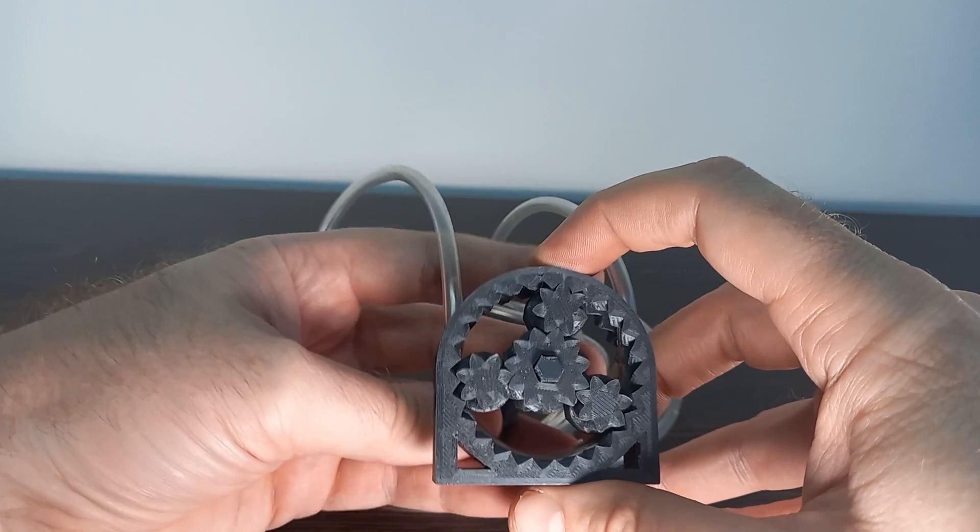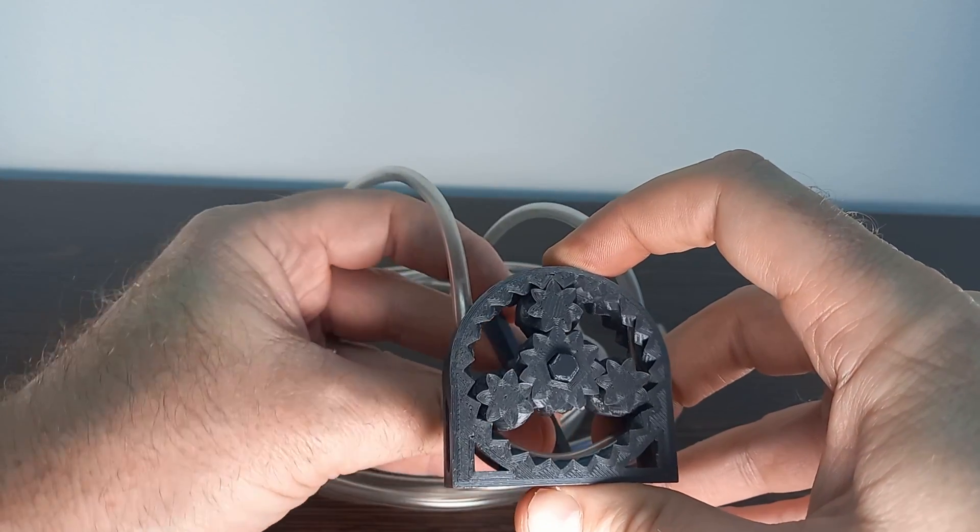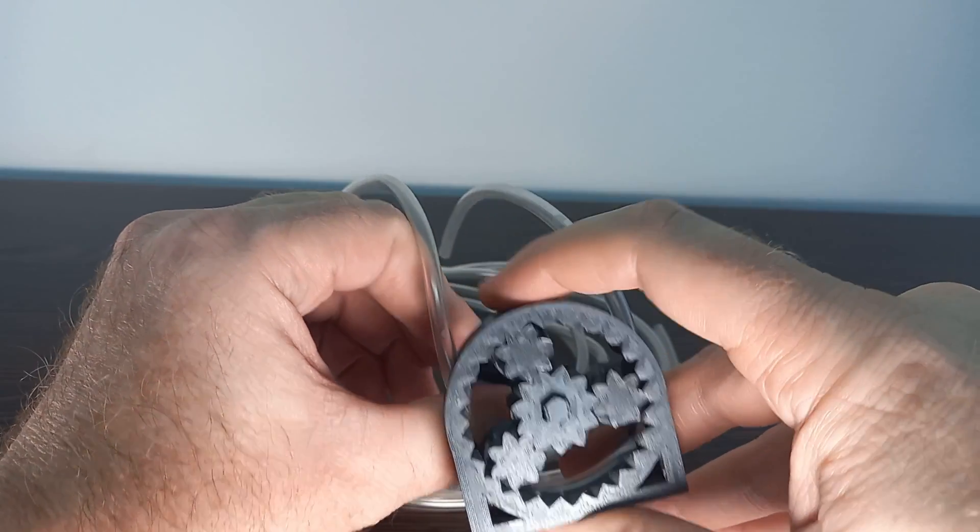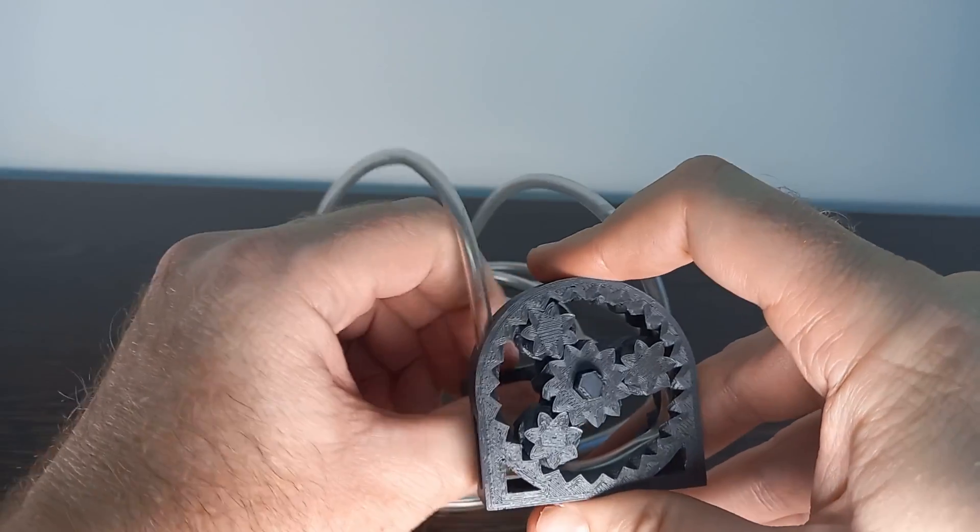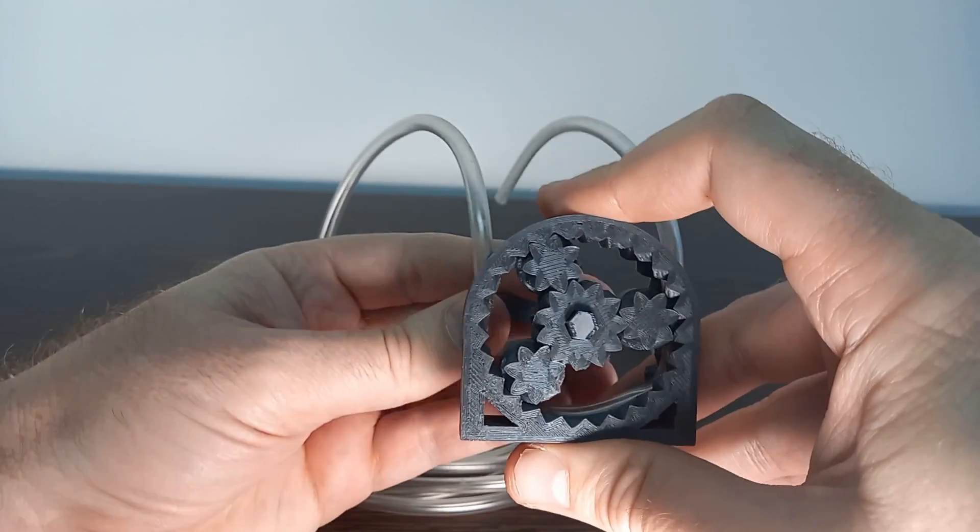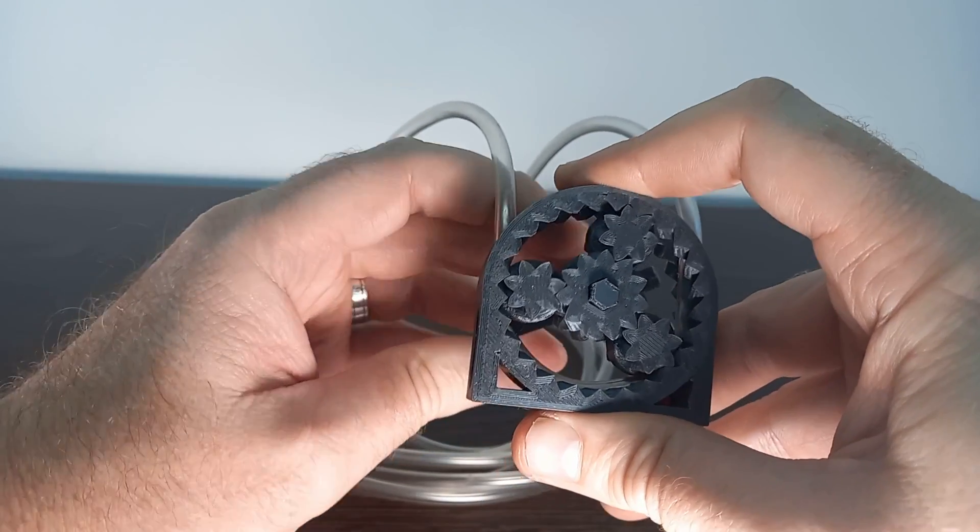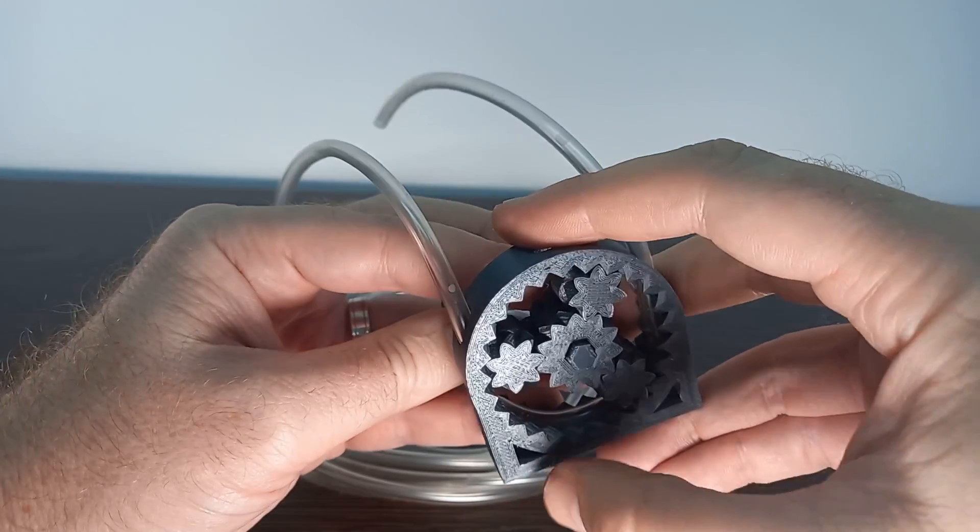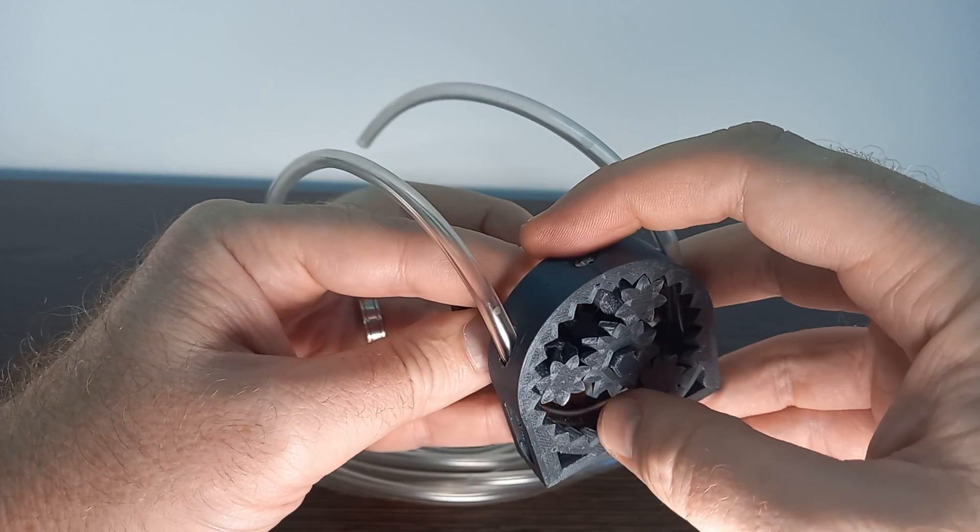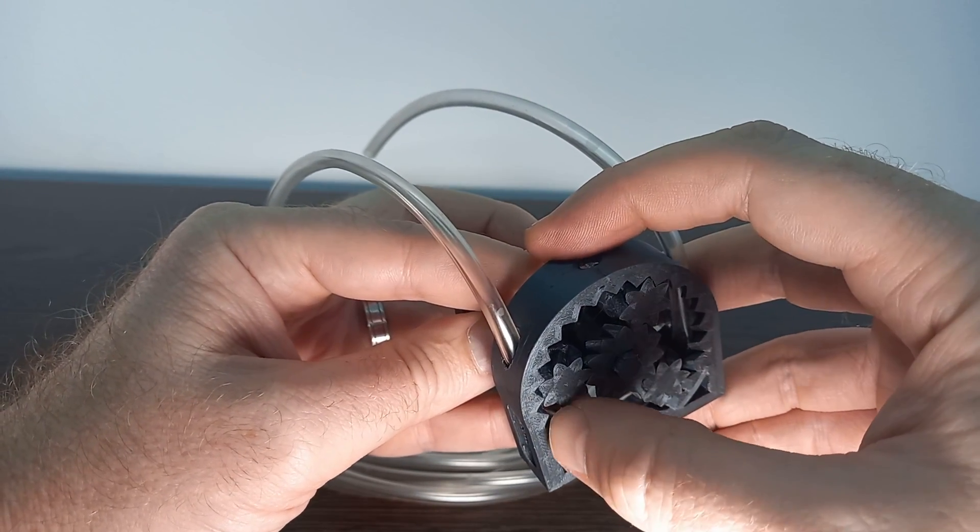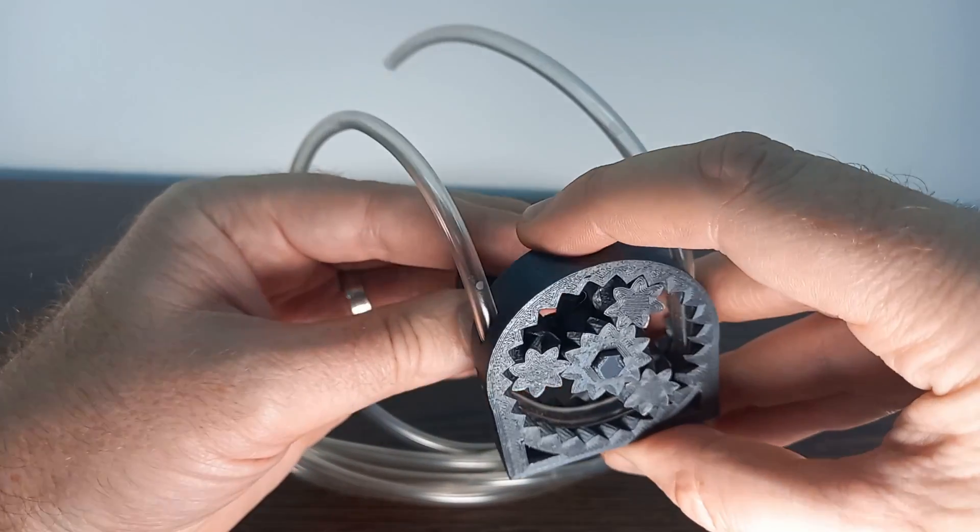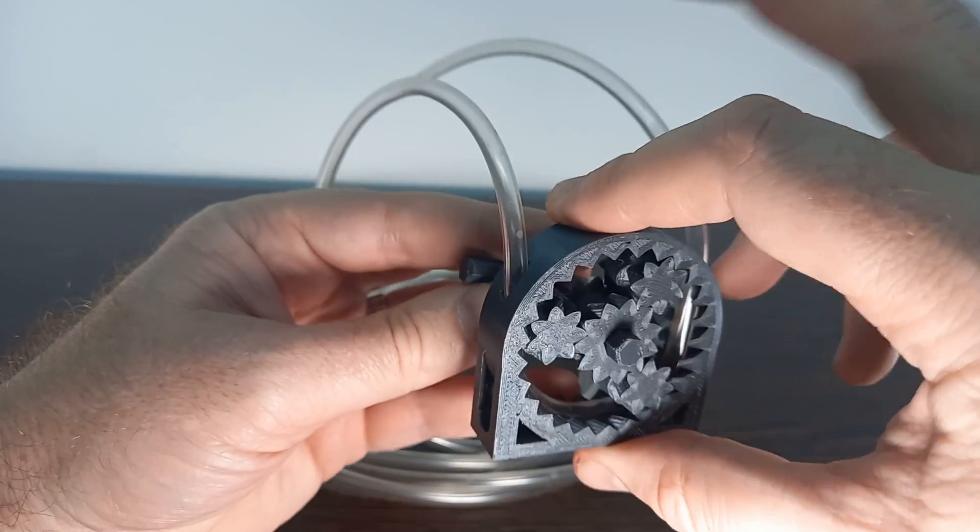So as you turn this device, these cogs are turning around on the inside here. As they turn, they are squeezing the pipe, and as they squeeze the pipe, they are pushing the water out on the other side.